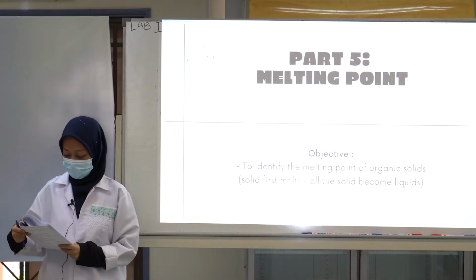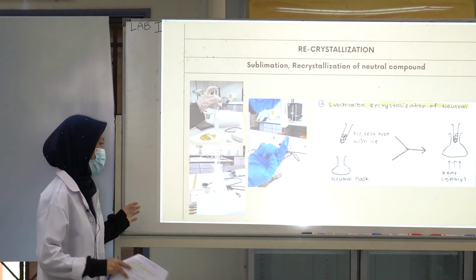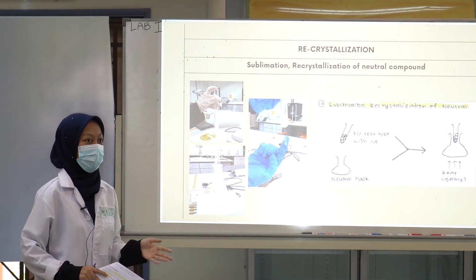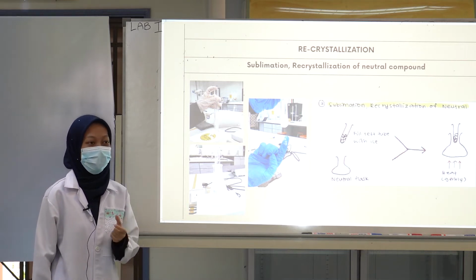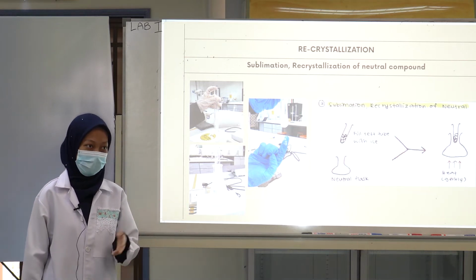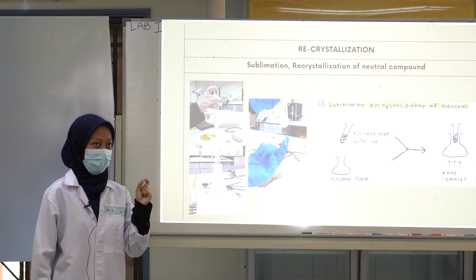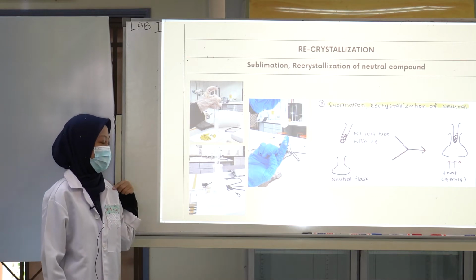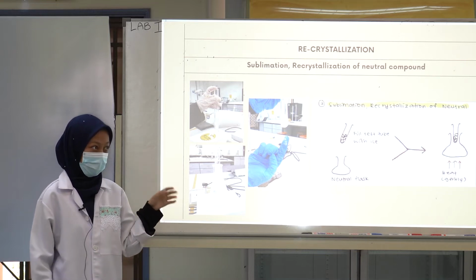Okay. And then we need to continue until all the compound has sublimed. So basically sublimation is the opposite process of evaporation. Evaporation is from liquid to gas, but sublimation is from solid to gas and then gas to solid.